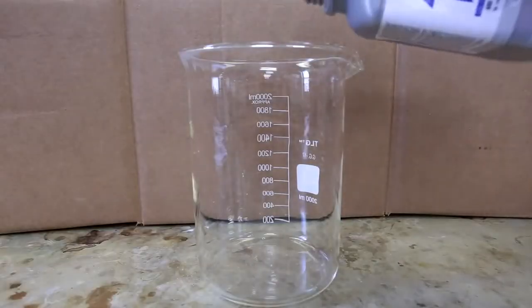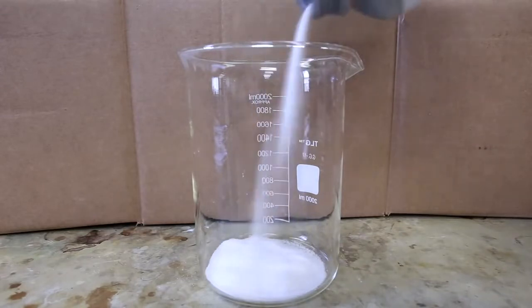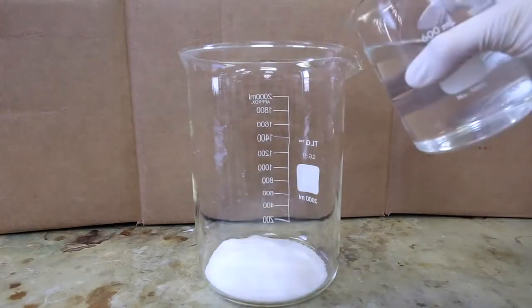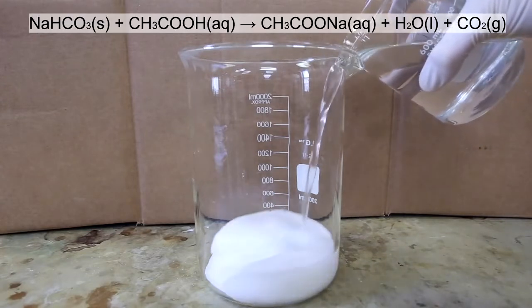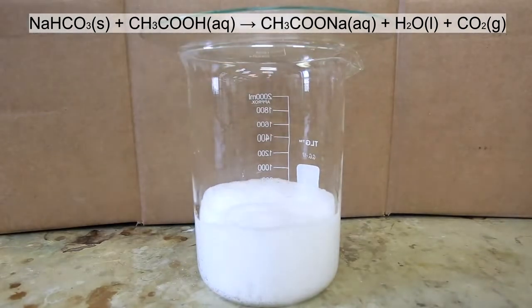First, enough sodium bicarbonate was added to cover the bottom of the beaker. The amount added is arbitrary and it's in a large excess. Next, enough 6% vinegar was added to wet all of the sodium bicarbonate. Immediately upon the addition of the vinegar, there'll be a lot of bubbling due to the release of CO2 gas. A watch glass is placed on top to keep the CO2 gas trapped inside.